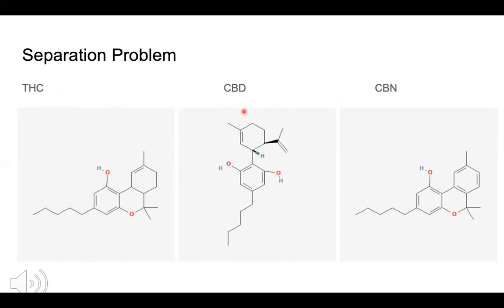So that also emphasizes the importance of choosing a good method, because a lot of the compounds in their biosynthesized form are not stable. So we're going to want to still be able to analyze those and quantify the concentrations.